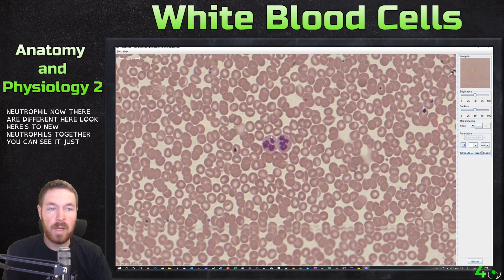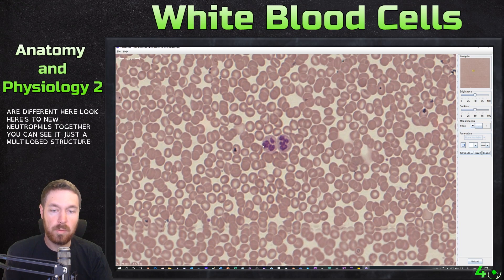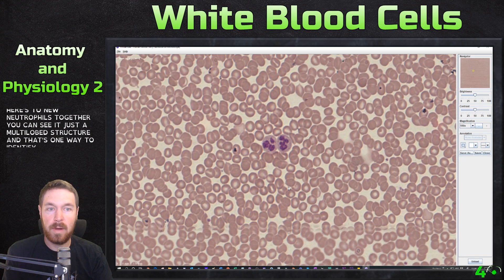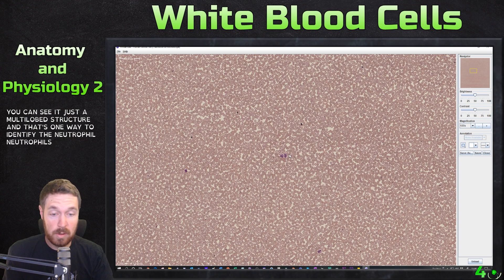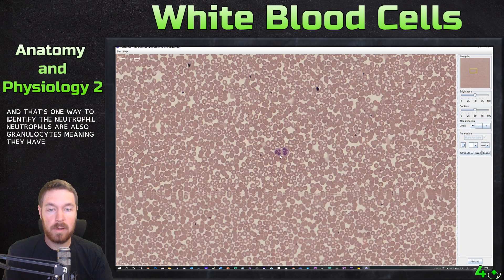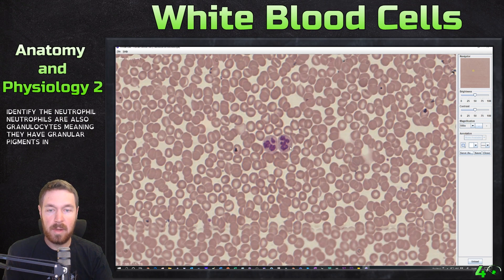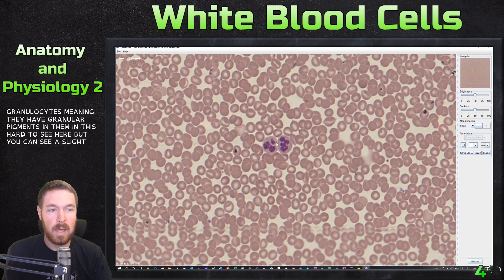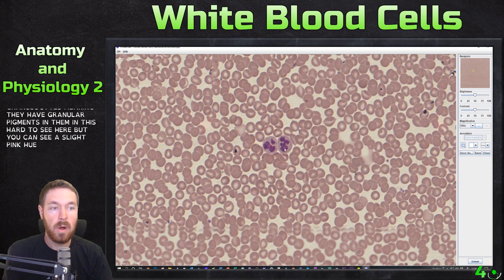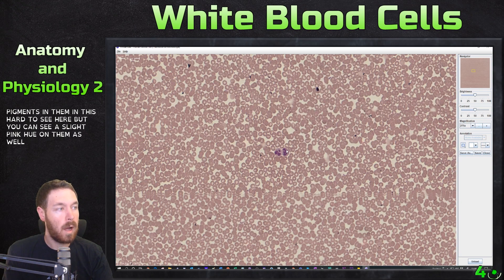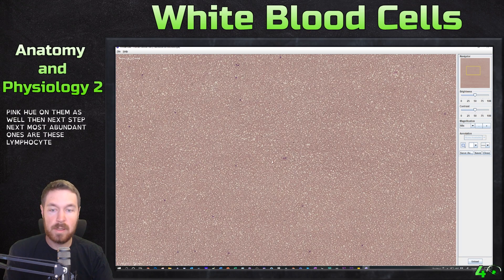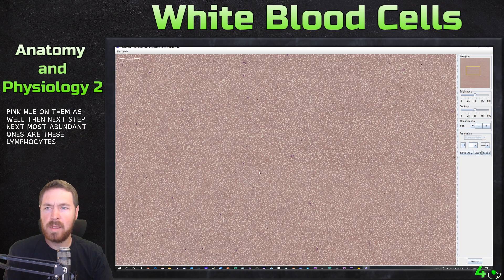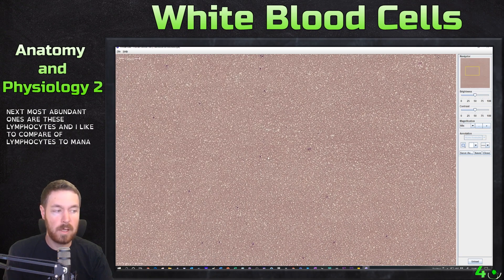Here are two neutrophils together — you can see the multi-lobed structure, which is one way to identify a neutrophil. Neutrophils are also granulocytes, meaning they have granular pigments in them. It's hard to see here, but you can see a slight pink hue on them as well.